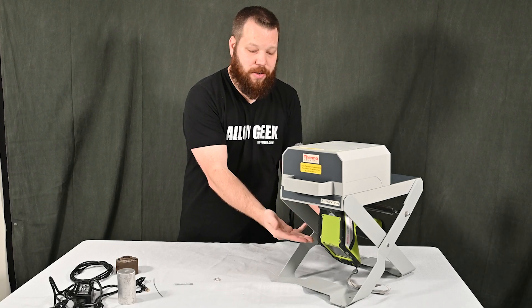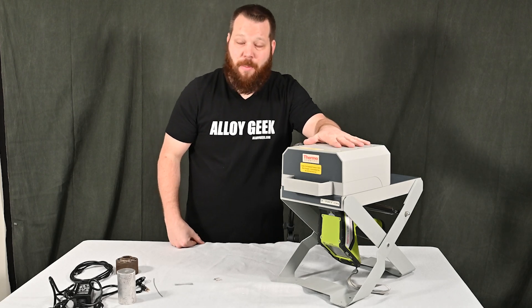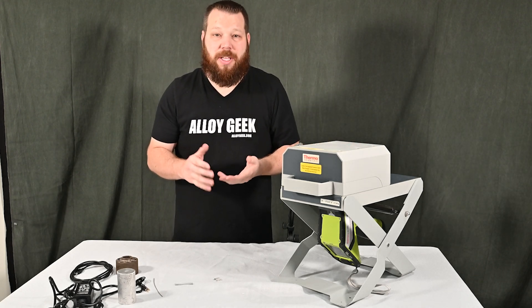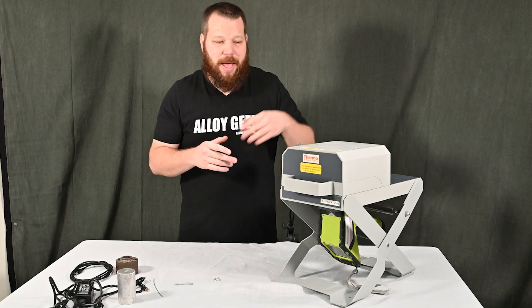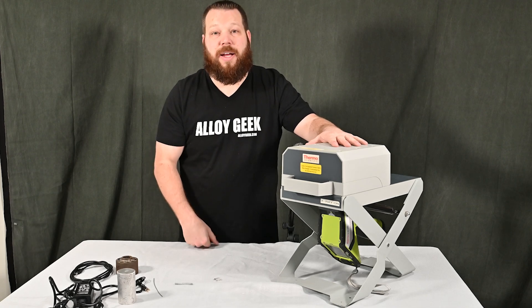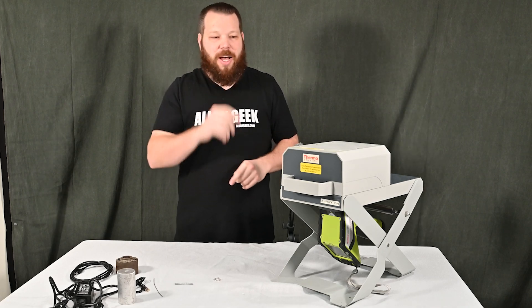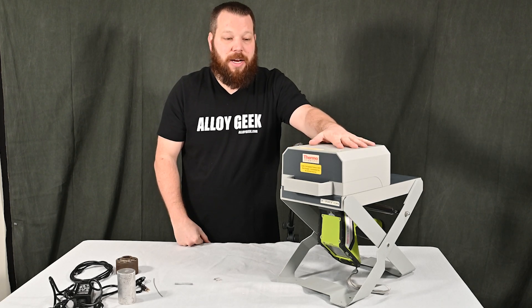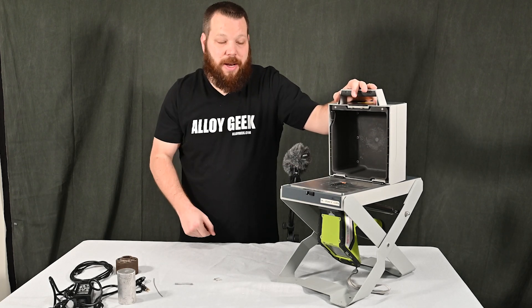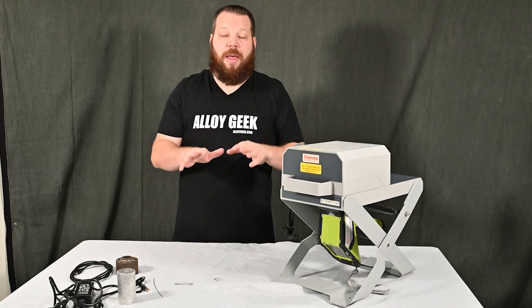These mobile test stands have a nickname: the 'finger cutter.' They have steel legs that accordion down, and a lot of people get paranoid about that. These portable test stands are heavy — about 20 pounds — and carrying that across an acre of a mining site is a lot. In my opinion, this should just be a desktop test stand, because you can throw those in the truck, they don't require external power, they're much more simplified, they run off the same RFID technology, and they're less expensive.